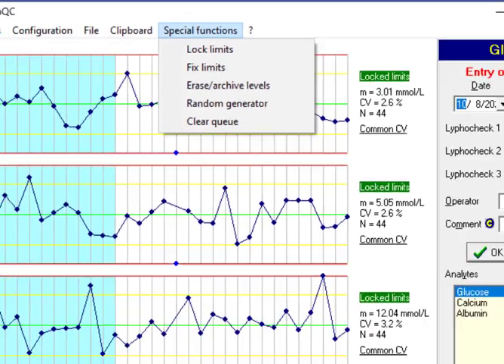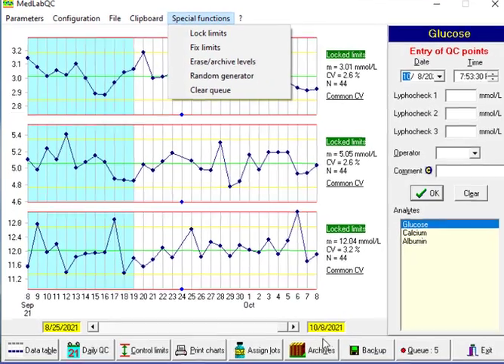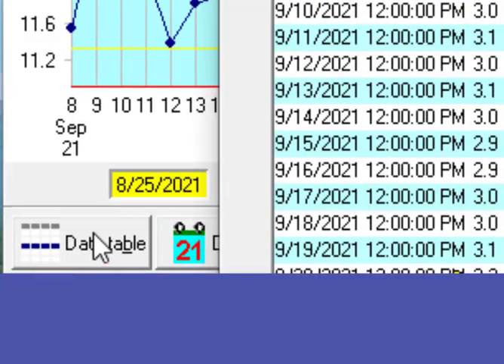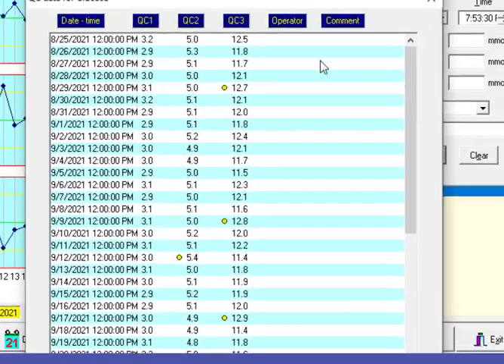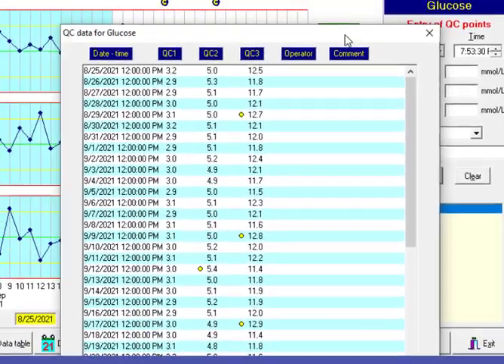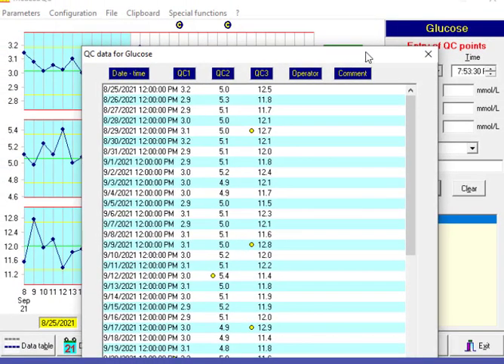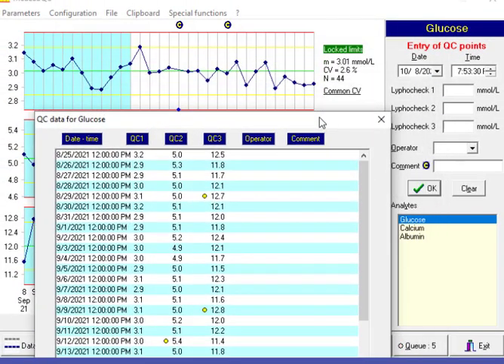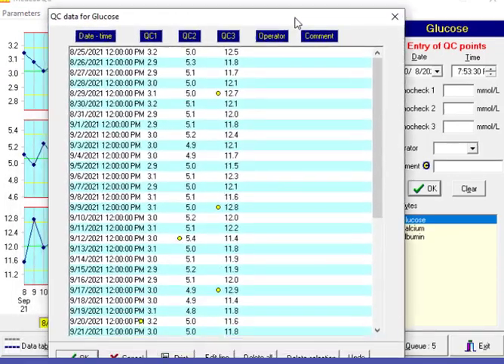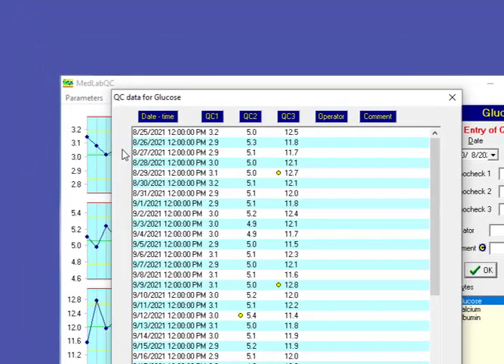At the bottom of the page we have data table which is all the data that has been shown on these charts, date and time.